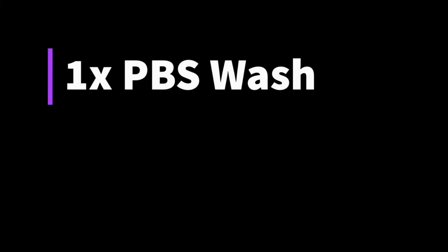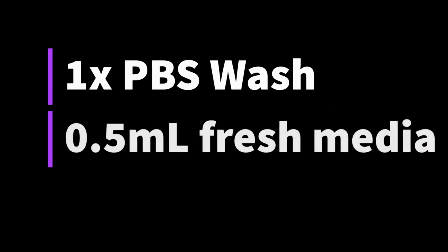When you are ready to transfect, aspirate the growth medium, wash the cells once with PBS, and add 500 microliters of fresh growth medium.